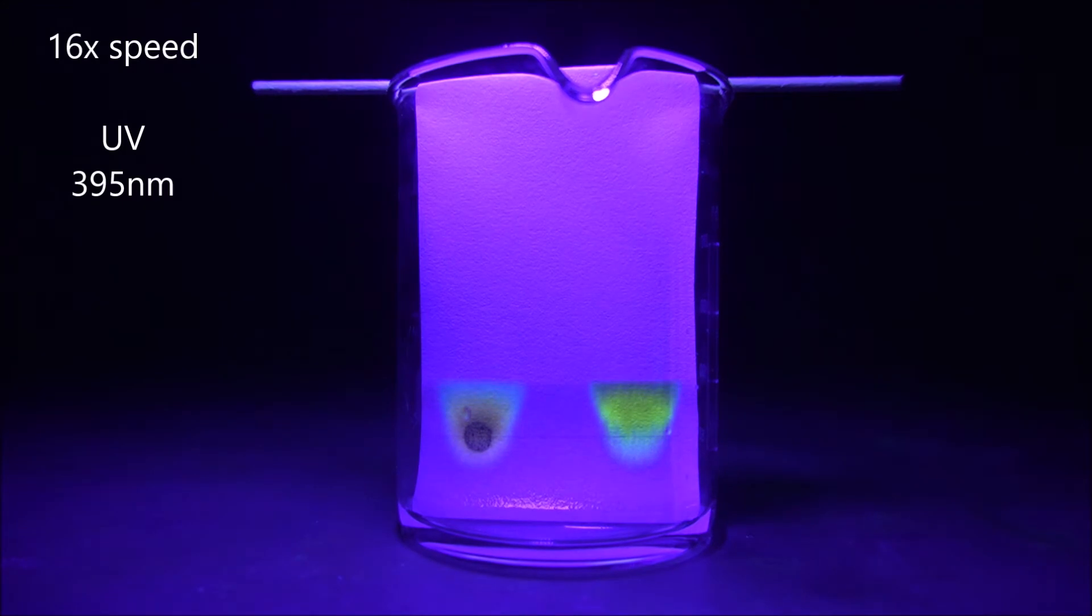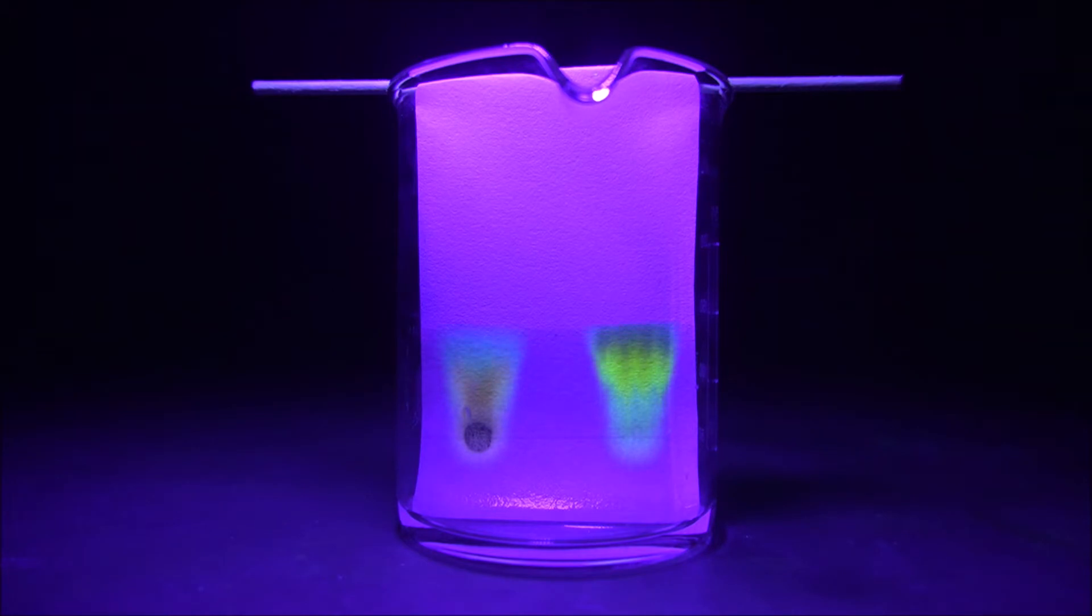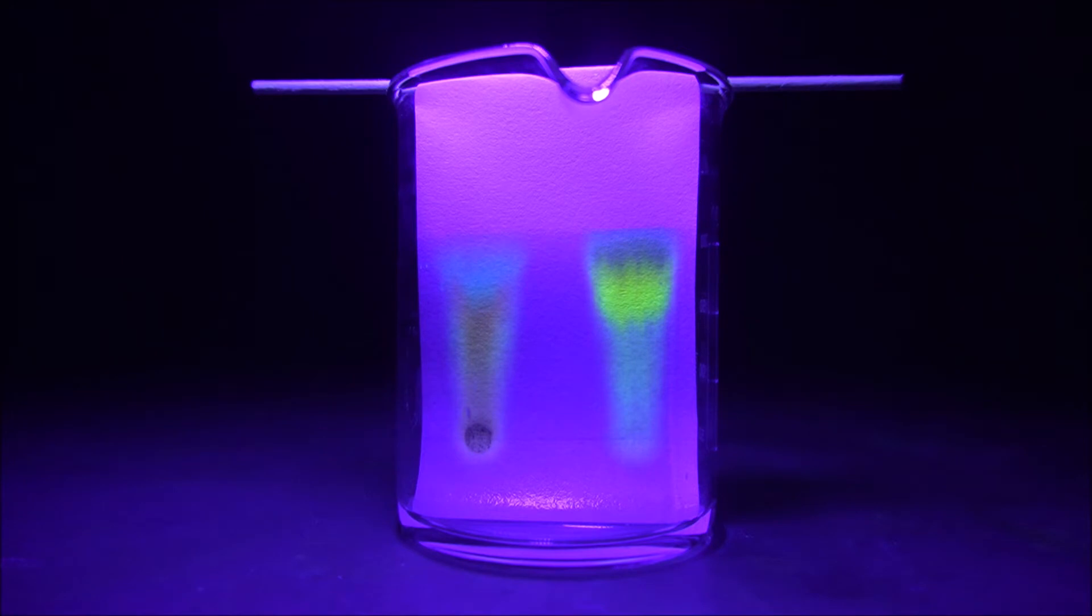Observe the development of the chromatograms under UV light with wavelength around 395 nm. In reality, the colors of the spots are much more vivid and shiny, which I found impossible to reproduce accurately in any video so far. Developing of the chromatograms takes about 15 minutes.